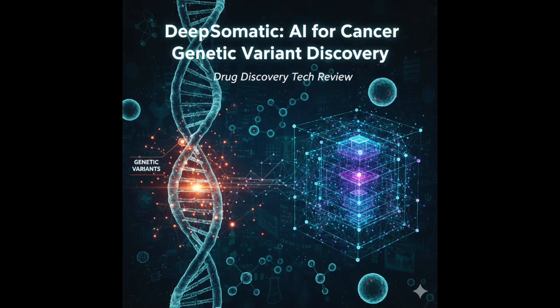That's not just an improvement. That fundamentally changes the utility of PacBio for indel detection in cancer, doesn't it? Completely. It basically made reliable somatic indel discovery using PacBio data a reality for the first time. And since many important cancer genes can be disrupted by small indels, that's a huge clinical and research advancement.